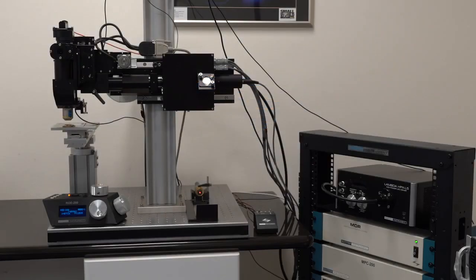The Sutter Moving Objective Microscope, or MOM, is not a new product. However, we constantly add new features, alternative paths, and functionality. Today I'd like to give you a quick tour of some of our newest MOM features. If you would like further info on the basic MOM design, please feel free to contact Sutter at any time.